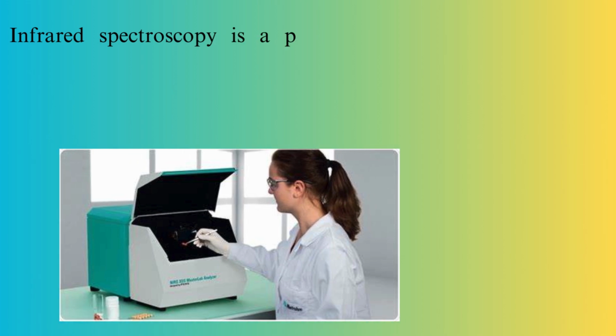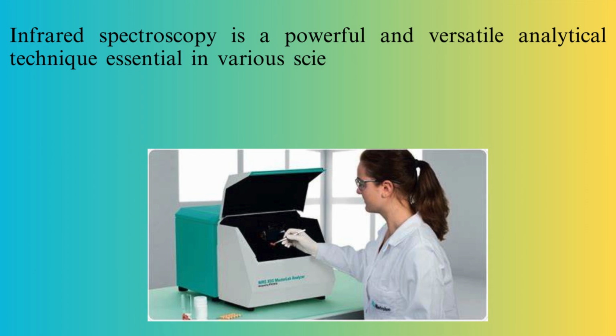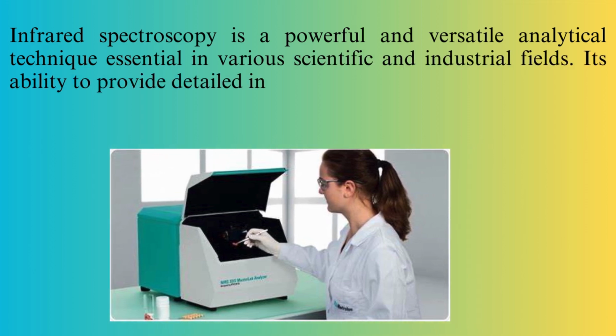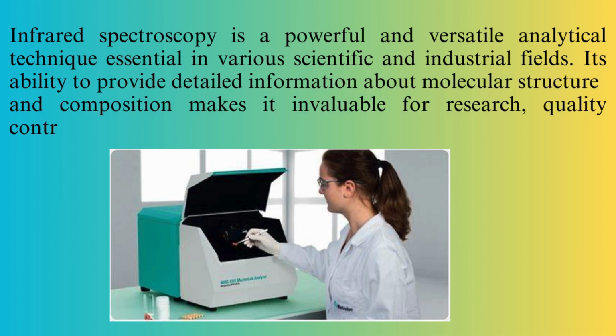Infrared spectroscopy is a powerful and versatile analytical technique essential in various scientific and industrial fields. Its ability to provide detailed information about molecular structure and composition makes it invaluable for research, quality control, and environmental monitoring.